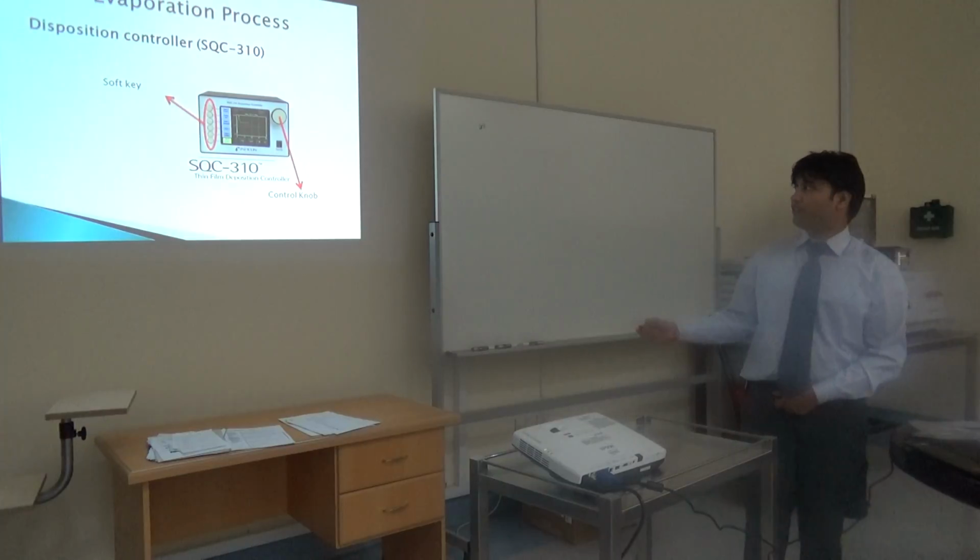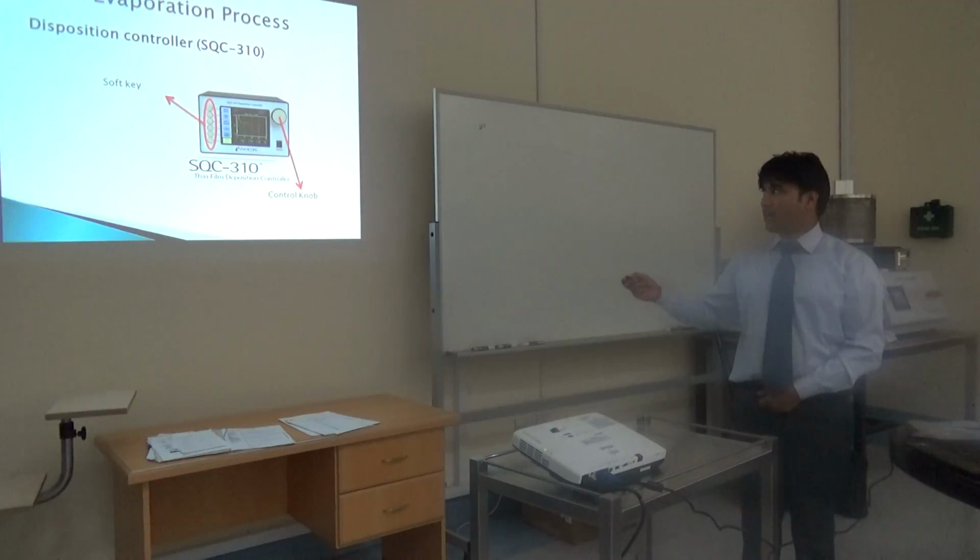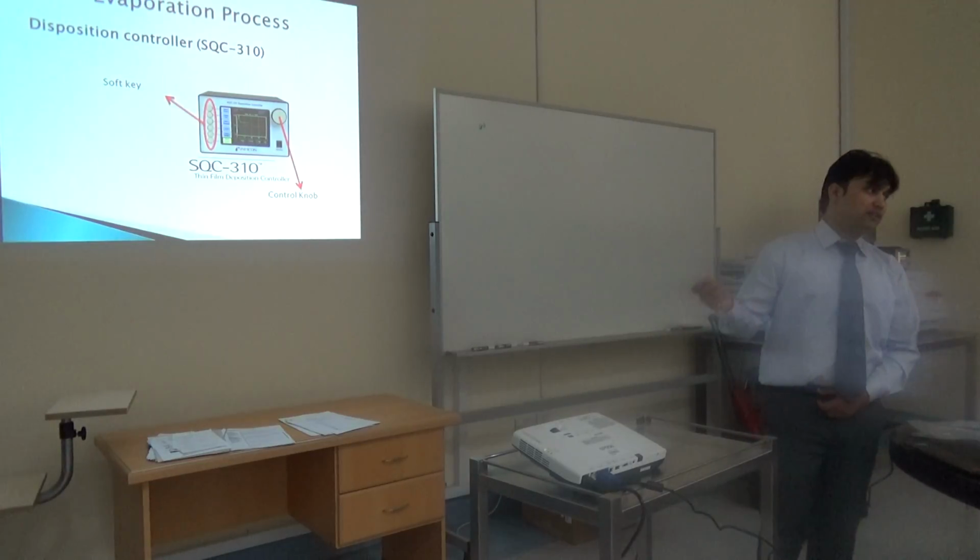Next, this is called the soft key. Soft key means if you are looking at the soft key, on the right side there is a mini tab, same like our mobile.